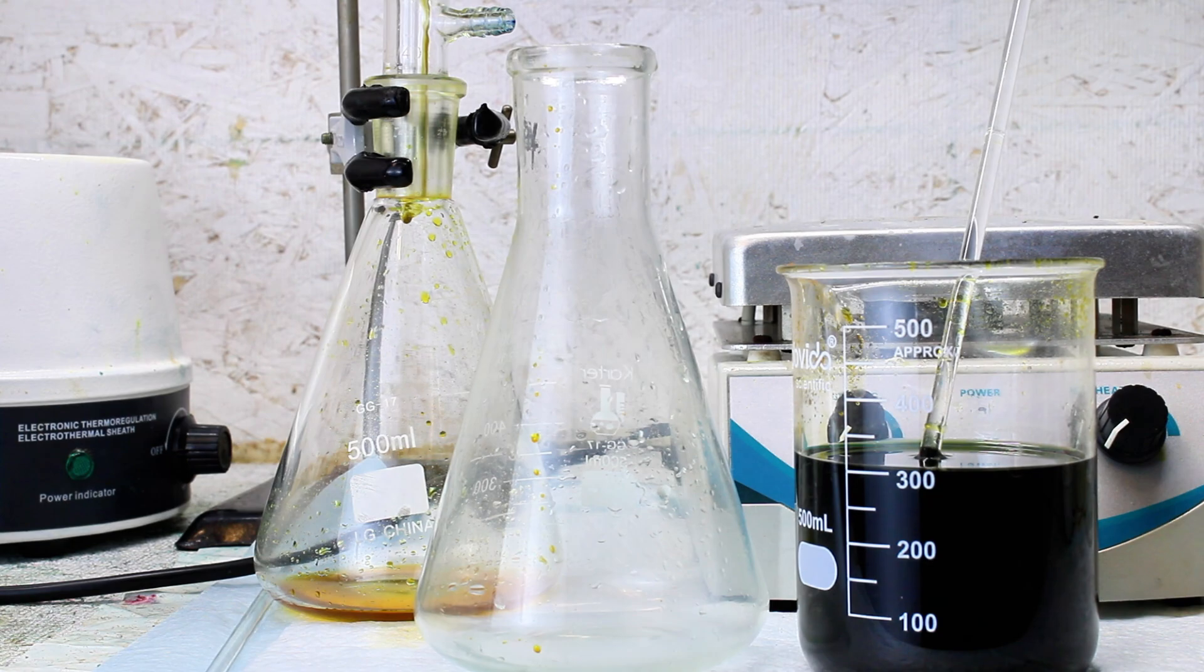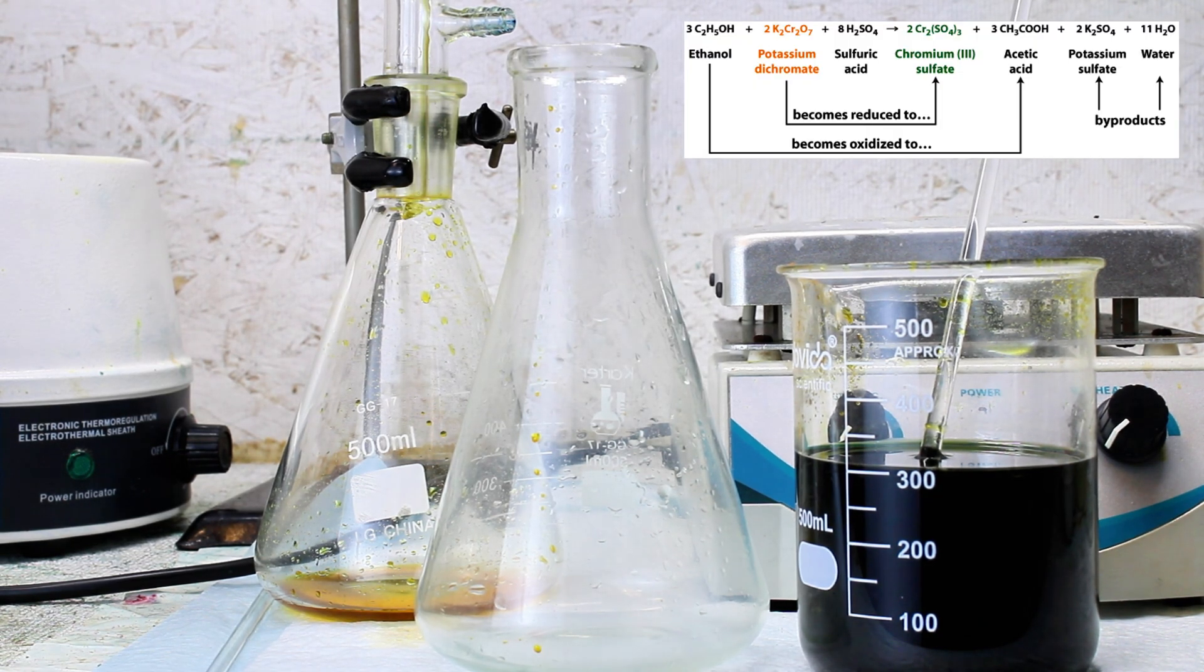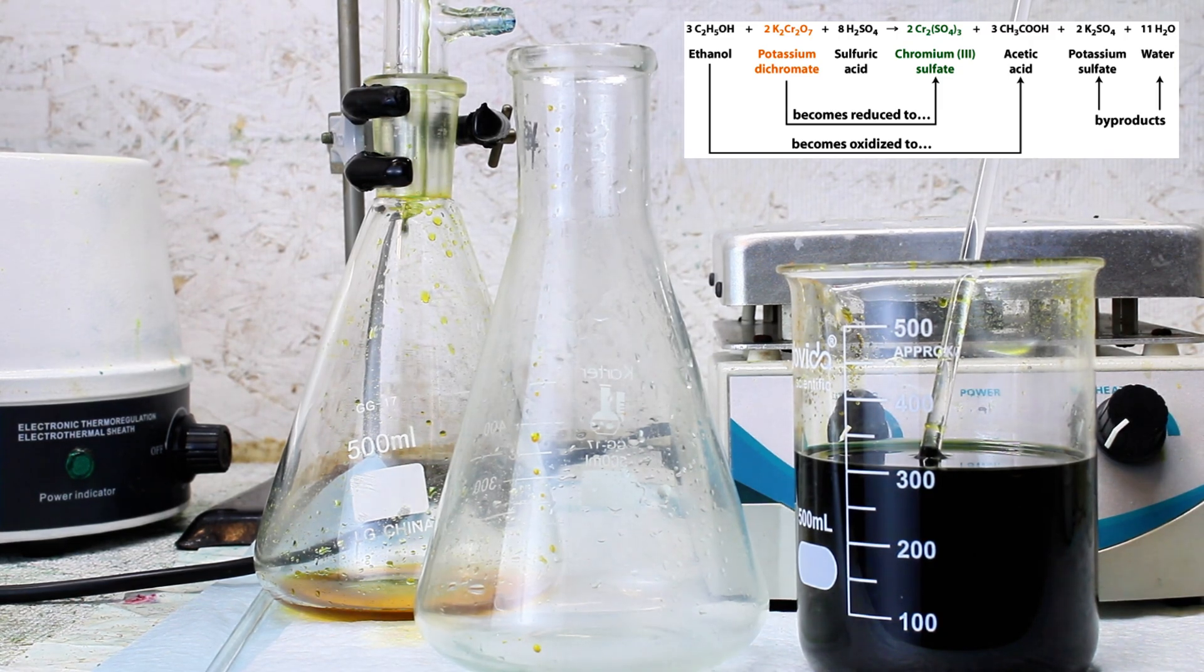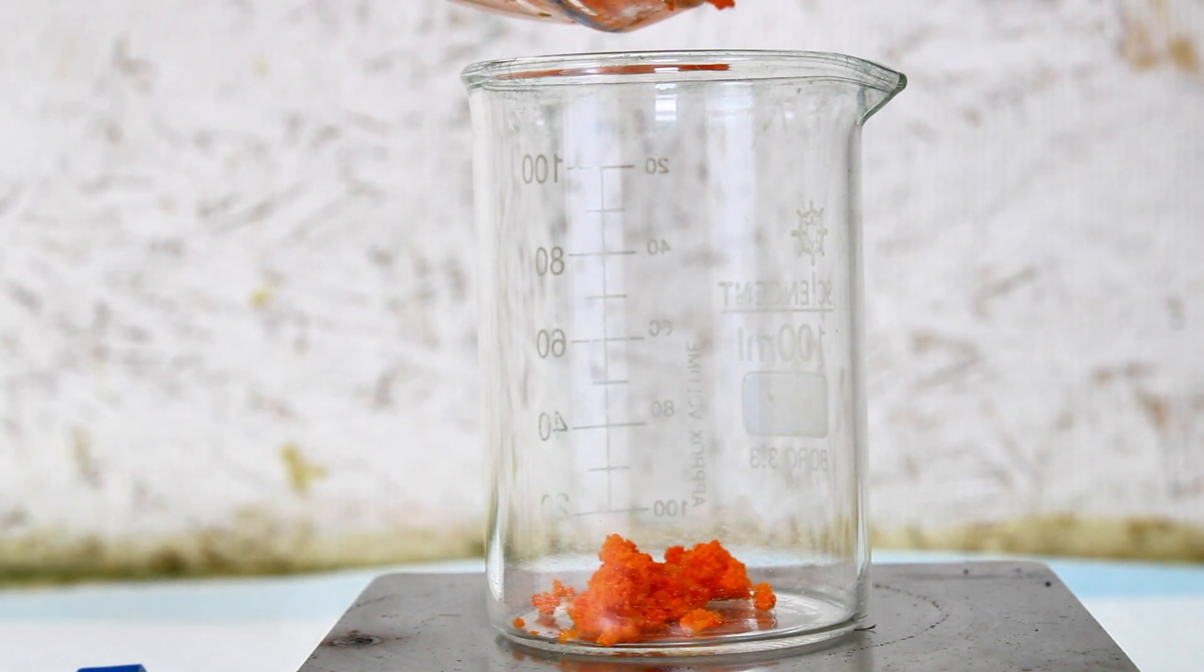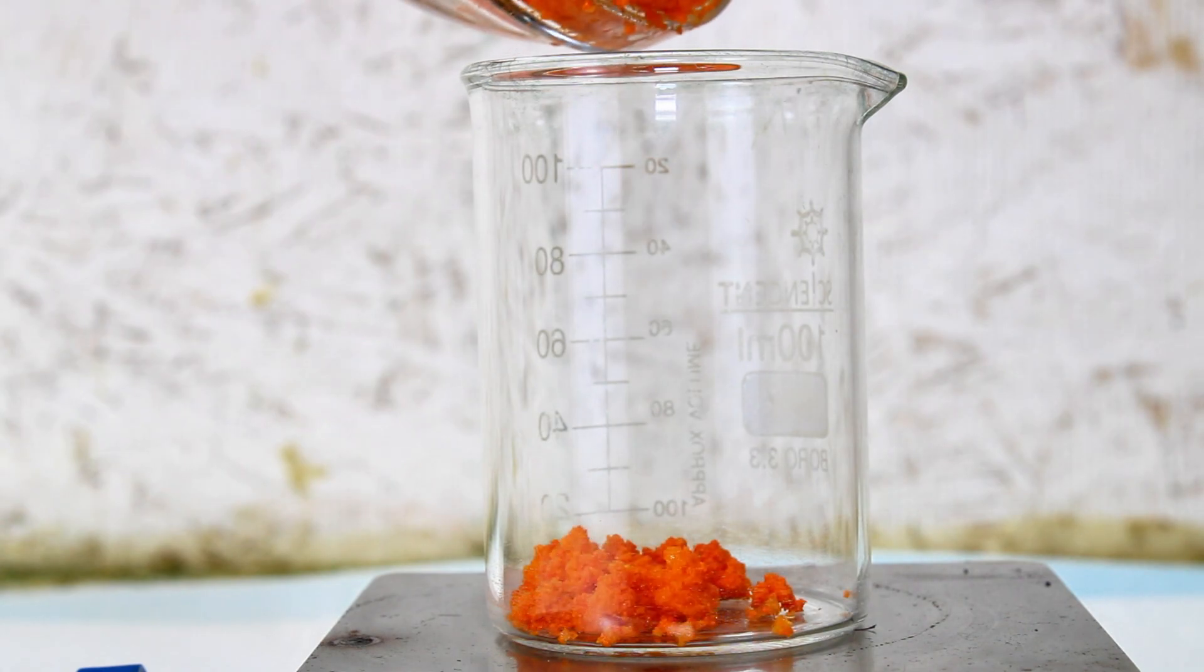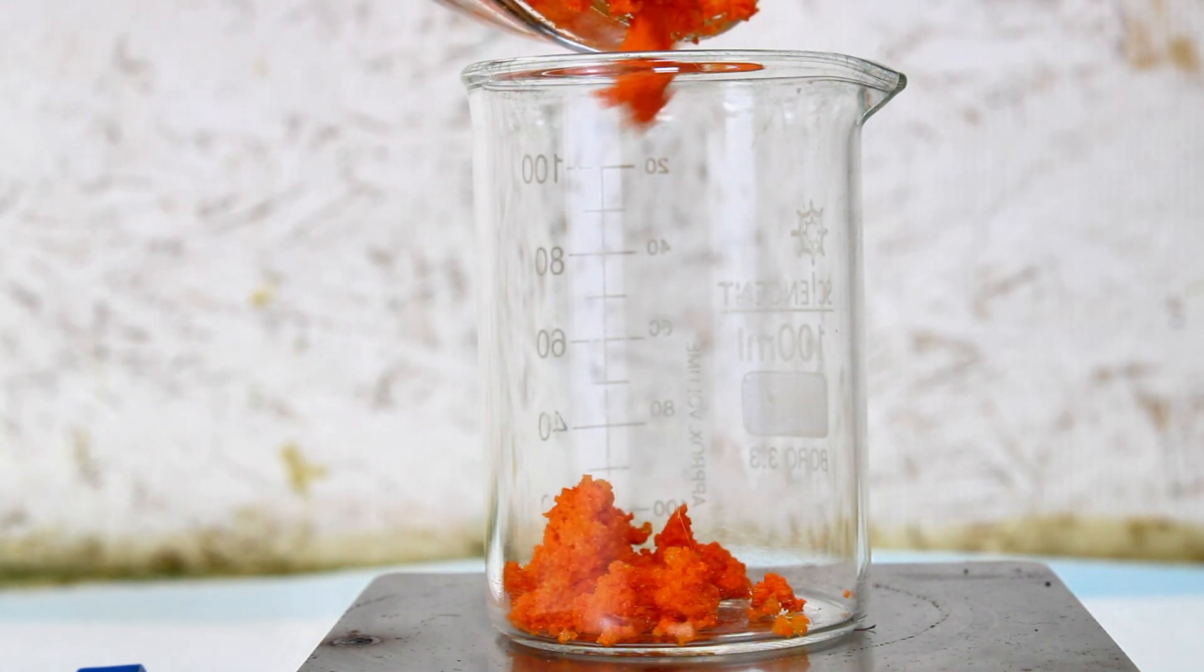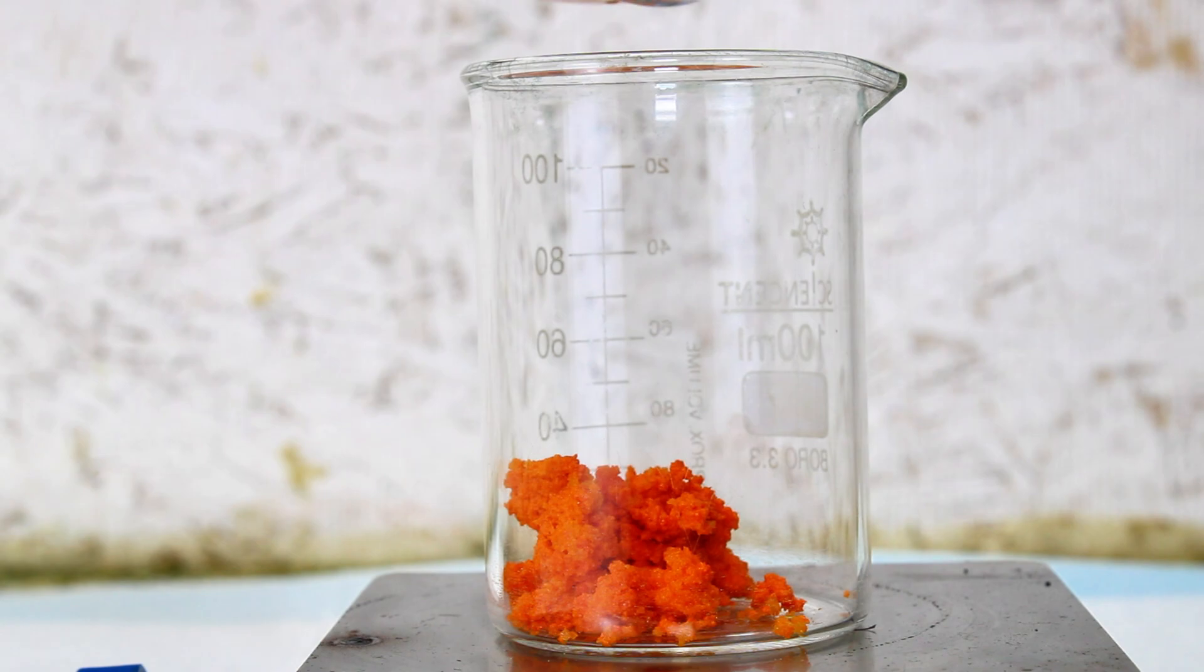Dichromate can also be used to qualitatively test for reducing agents or alcohols by turning to the green trivalent state in their presence. Chromate and dichromate behave nearly identically in solution, and the main reason potassium dichromate is so strongly preferred in most chemistry labs is that unlike sodium chromate or dichromate, it's not hygroscopic.